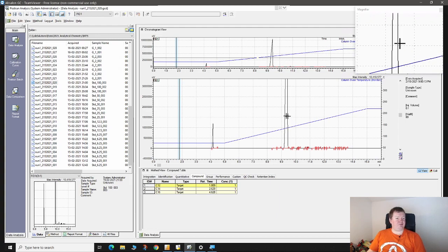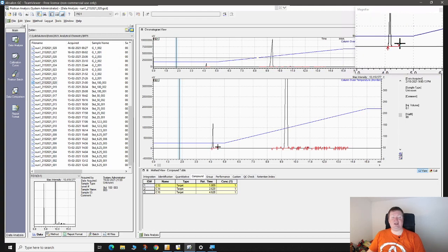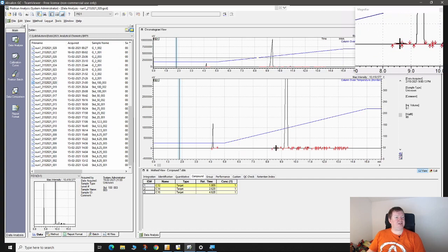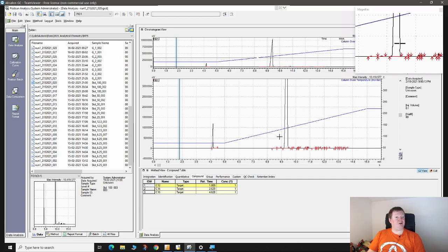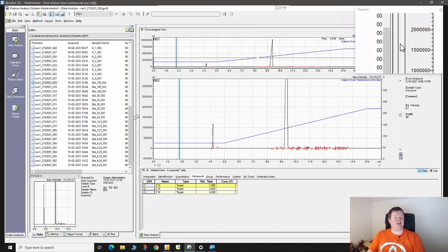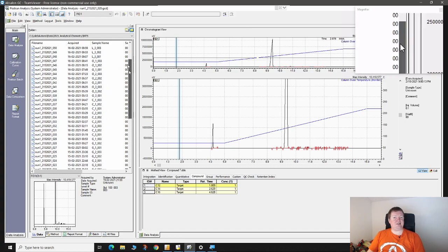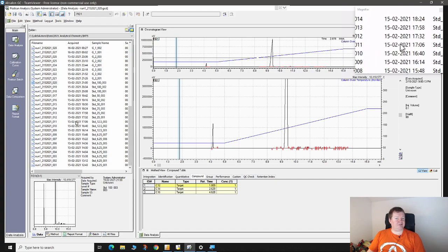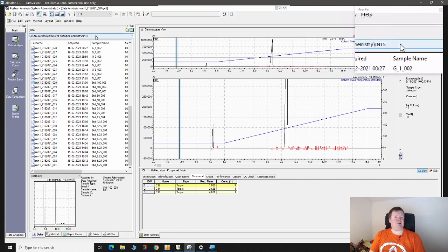Okay, so we have our peaks here. Now what you'll see here, the red markings, that's actually where the software has detected that there is a peak. So in this case, you can see it detects the first peak, then it detects some other smaller peaks here, and the big one here, and then you have a bunch of other ones. This can partly be because of noise, and you can combat that by, for instance, subtracting a blank sample. So let's see, did they run a blank for us? If they did, they didn't give it a name that I can recognize as a blank.